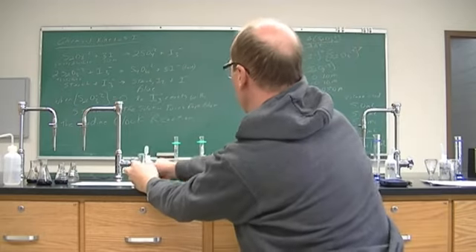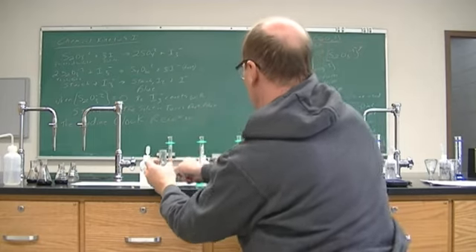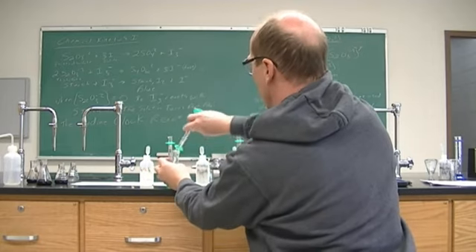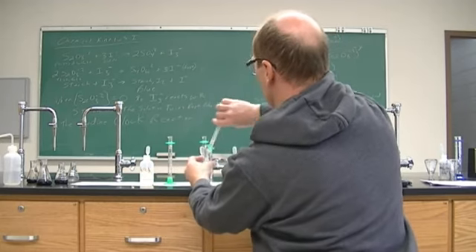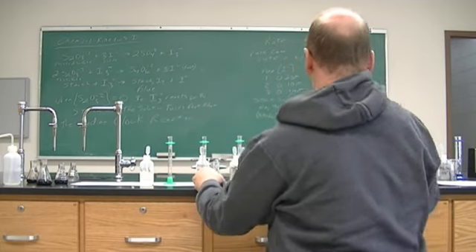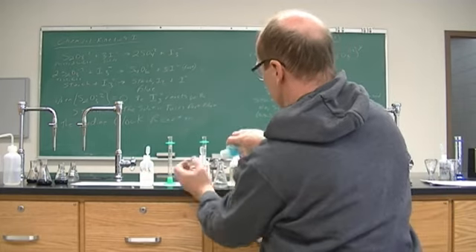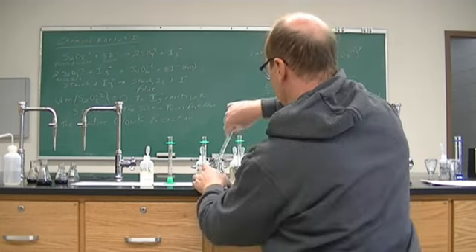Reaction vessel, and the starch, S2O3, KI. All right, drop of catalyst, and the S2O8, and we time it.